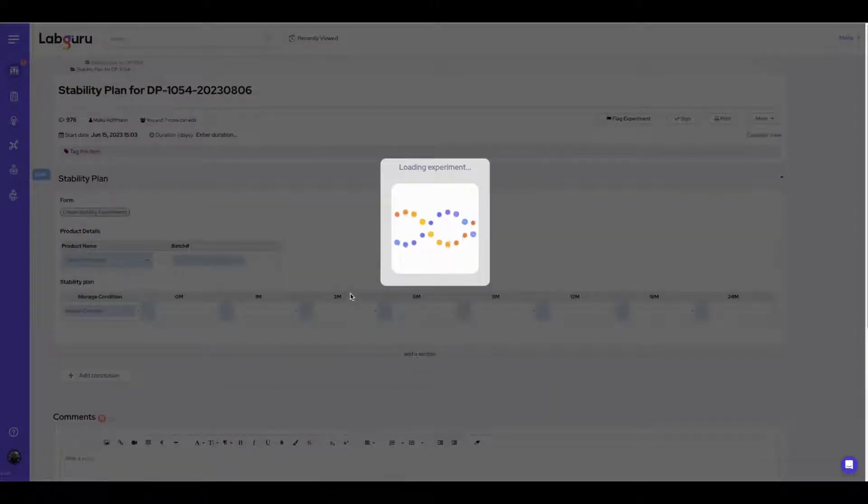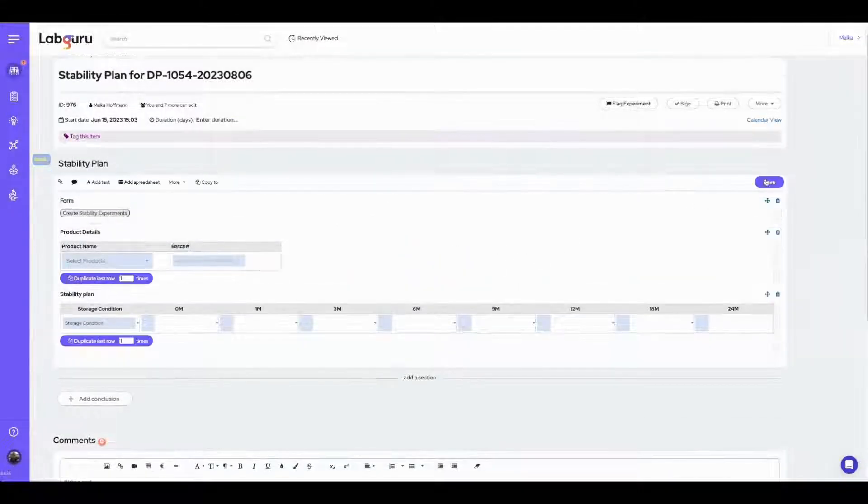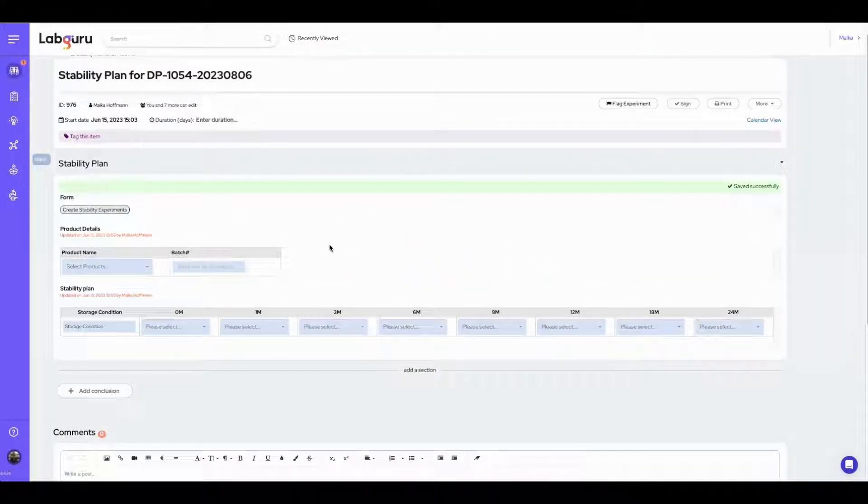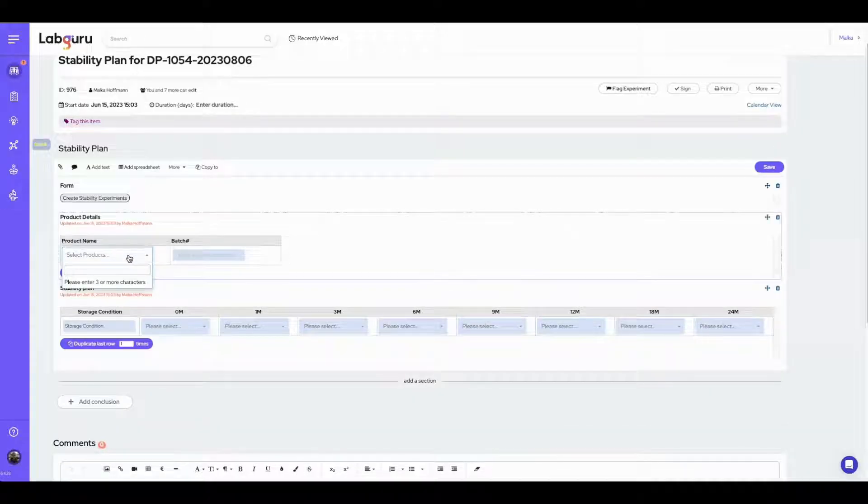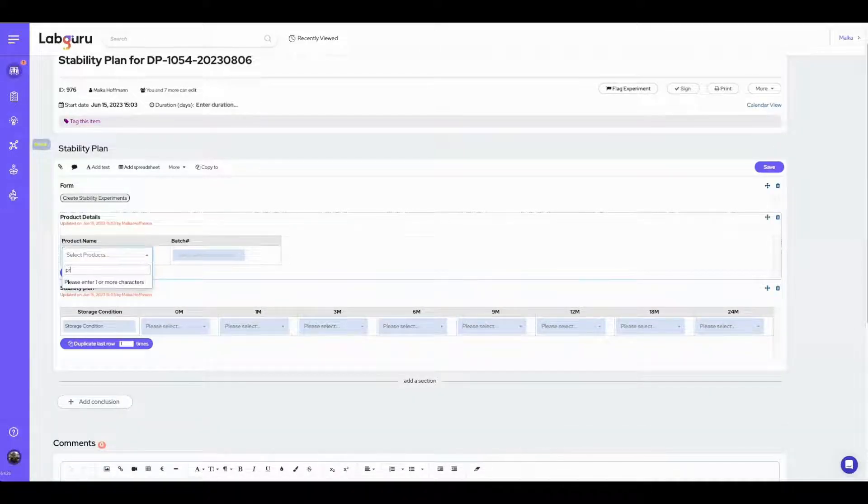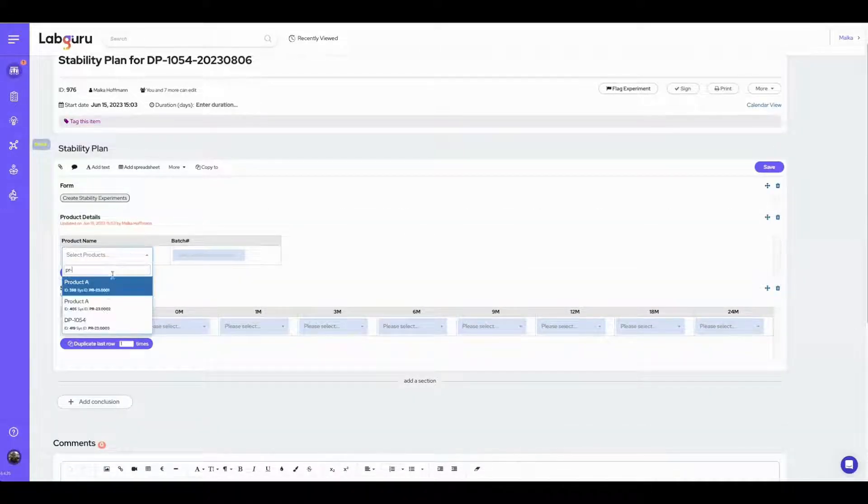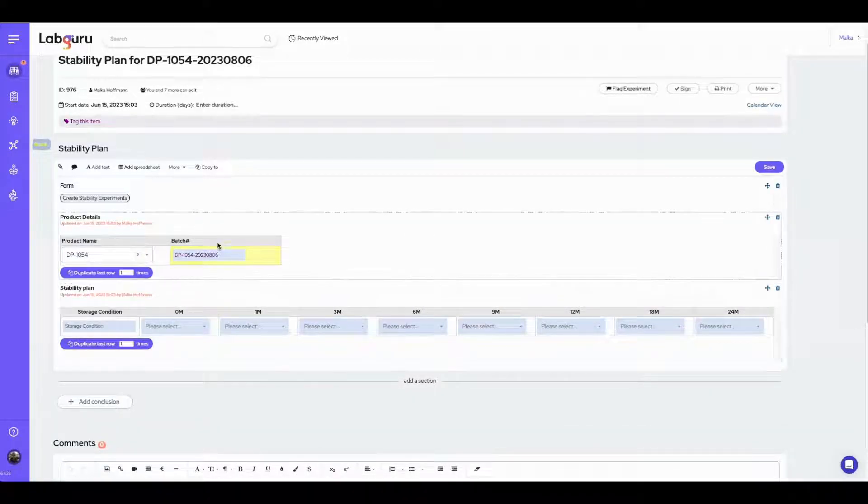Here in the newly created stability plan, I start with choosing the product that should undergo stability testing, and the batch number is populated automatically. I can also add more products if needed.